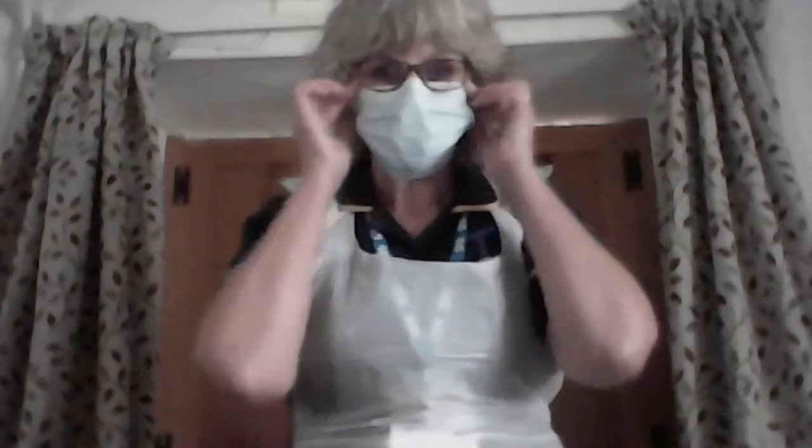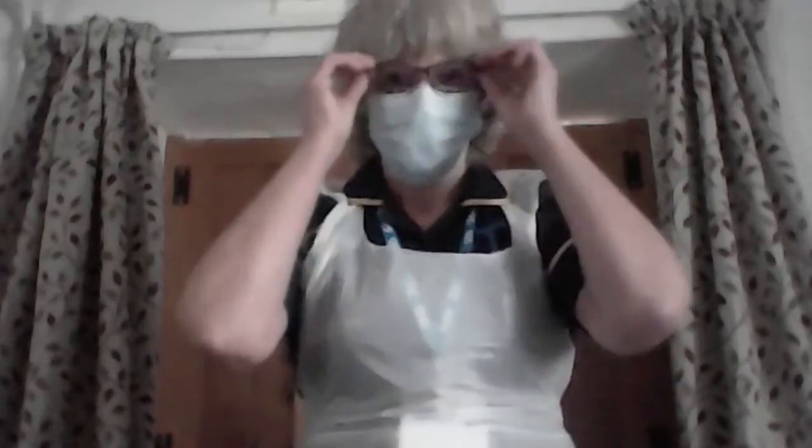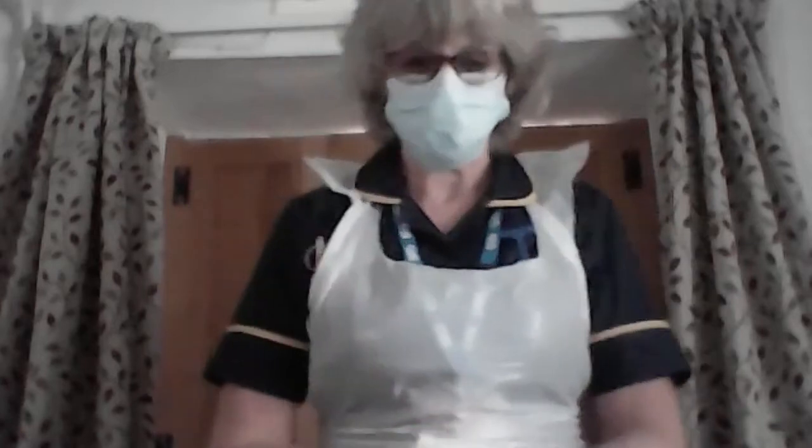You then place your mask over your face, press down over the bridge of the nose and pull the mask open underneath the chin. Just secure it across the top of the face and nose, under your glasses if you're wearing them. Just gel your hands again.